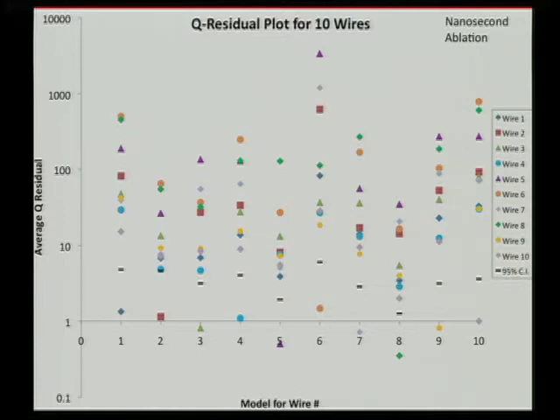And this is actually advantageous because if we compare, say, one particular brand to another, now we have not only one-dimensional data for one particular strand, we have multi-dimensional data from the entire bundle. So this is very advantageous. So we could possibly compare that bundle to, say, another manufacturer's bundle. Actually, that's our next step in this project.